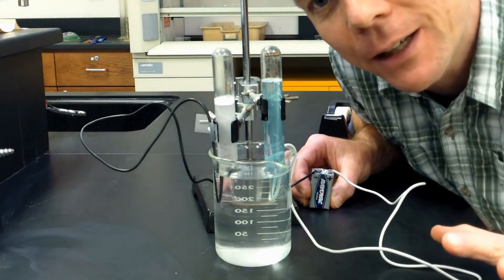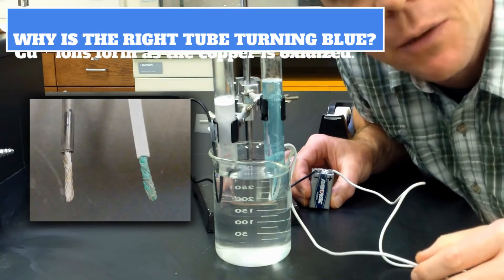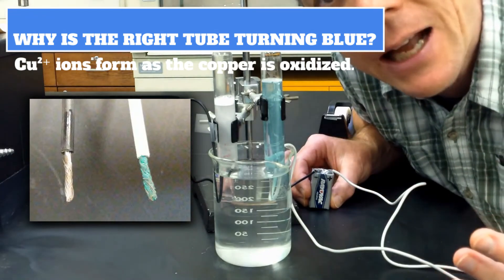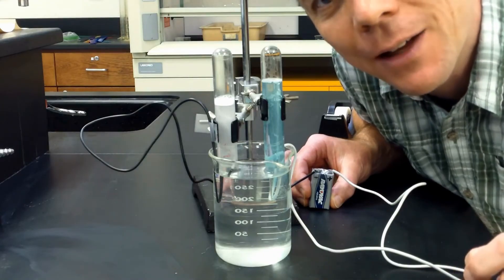Another interesting thing that's happening here in this experiment, we're also forming copper ions, and I think that's because of the wire that I used. We can see the blue tint that's being added to the water, and this is because of the formation of copper 2 plus ions.